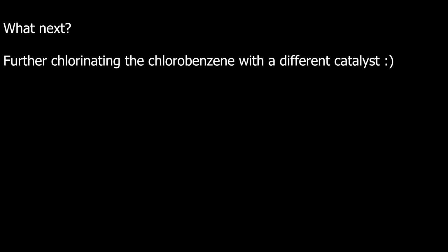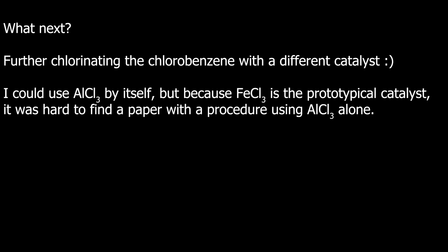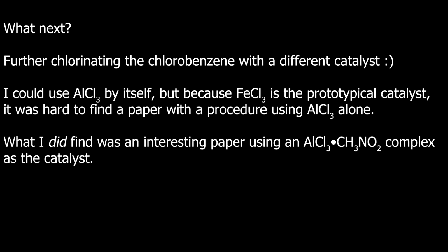What next? Further chlorinating the chlorobenzene with a different catalyst this time. I could use aluminum chloride by itself, but because ferric chloride is a prototypical catalyst, it was hard to find a paper with a procedure using aluminum chloride alone. What I did find was an interesting paper using an aluminum chloride nitromethane complex as a catalyst.